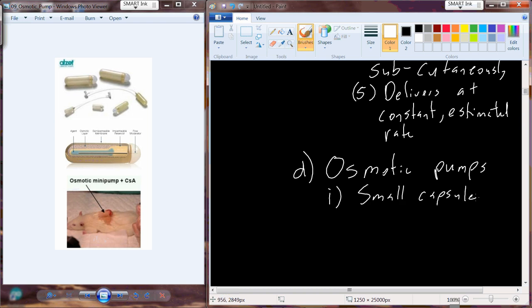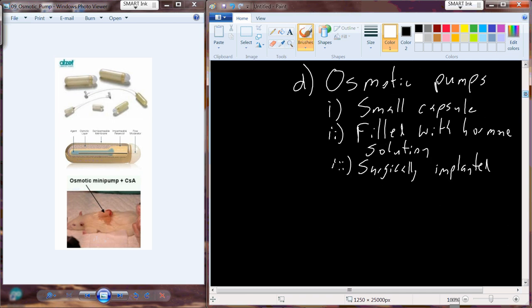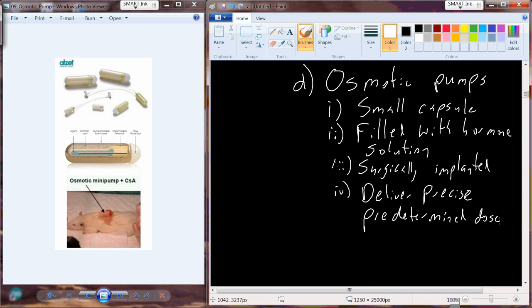So these are, again, small capsules. Very similar approach that we use with the silastic implant. Fill those up with your hormone solution, your hormone dissolved in some sort of diluent. Surgically implanted, it's basically a very similar surgical procedure that we would use to implant the silastic implant. It's going to provide us that very precise, predetermined dose. But they are quite a bit more expensive. So that's kind of your trade-off.